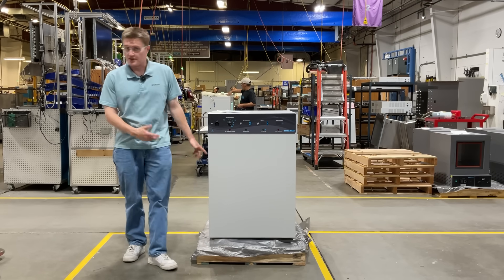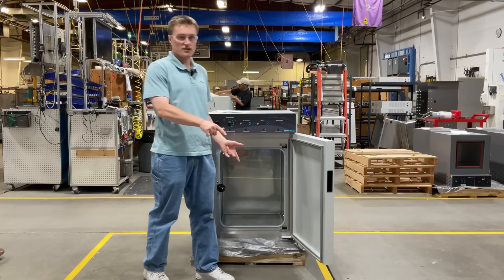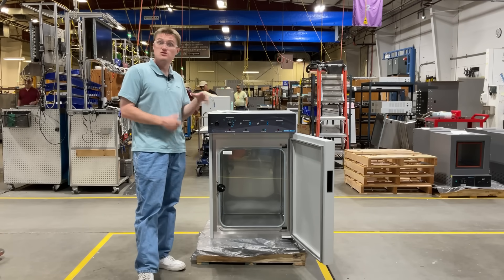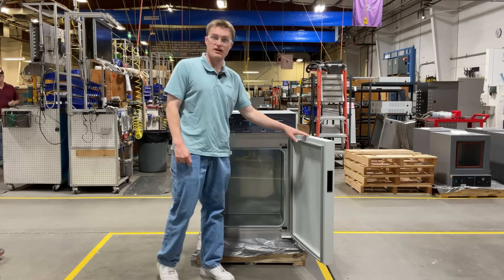Now let's take a look inside the unit. The SCO5W features a double door technology with an inner glass door to help you monitor your samples without actually opening up the chamber, and a heated outer door to help prevent condensation.